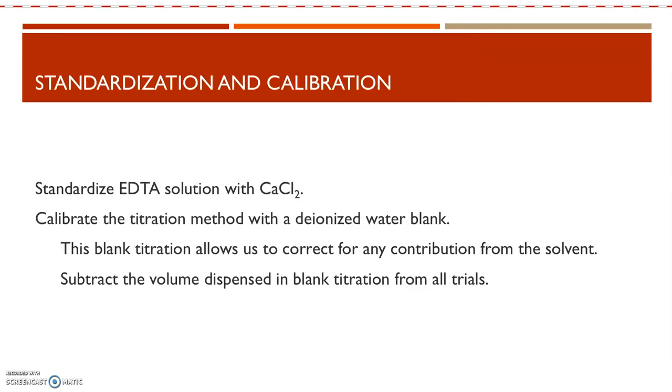Aside from doing the titrations themselves, we still need to standardize the EDTA solution, like we standardized the sodium hydroxide last week. In this case, we're going to use calcium chloride. So we're going to use a calcium chloride solution of known concentration. You're going to weigh out that calcium chloride and dissolve it, and then use your EDTA solution to titrate that.